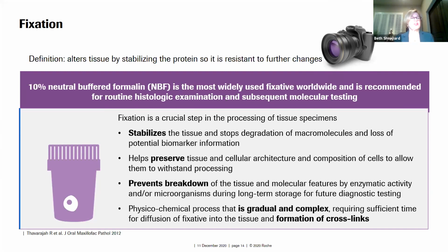So fixation is a crucial step. It stabilizes the tissue and stops any kind of degradation. It helps preserve the tissue so that we can actually see the cellular architecture. It prevents breakdown of the tissue from any kind of enzymatic activities or even microorganisms.